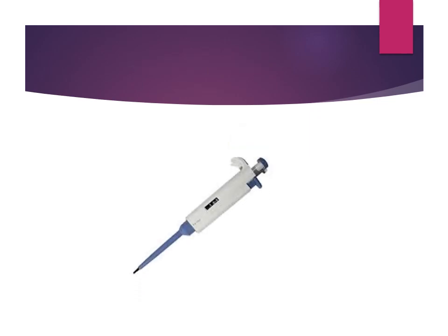Now the next one, that you must have seen. This is the latest pipette which we are using, the automatic pipette. Here also we can take a measured amount of any liquid, like in COVID testing we are doing, in the molecular labs we are doing. There you have to take a very small amount in the PCR labs. That is not possible with the glass pipettes.